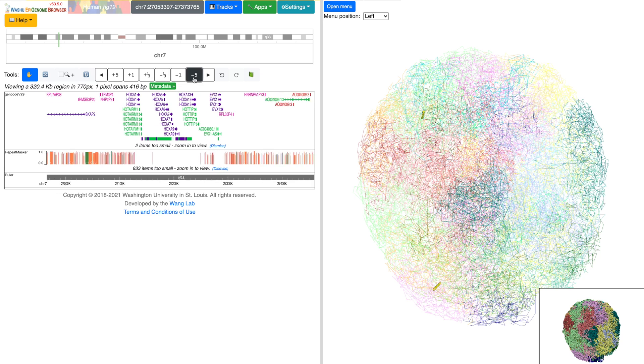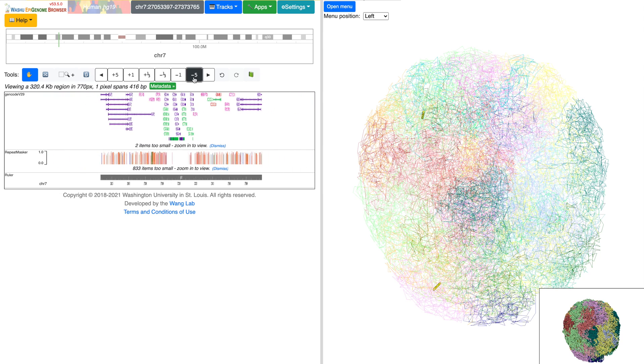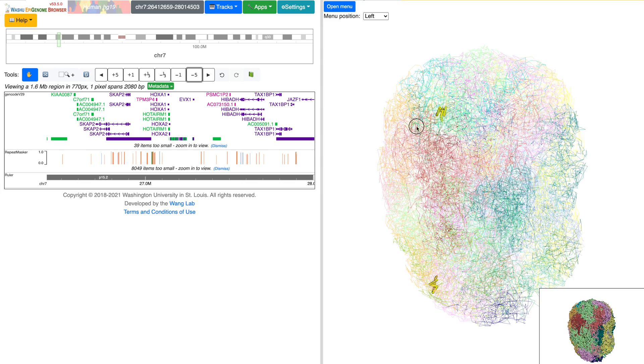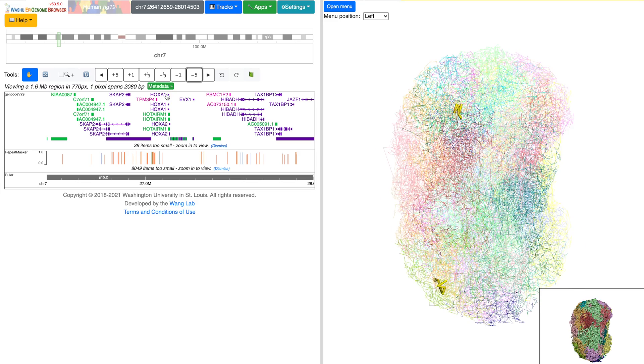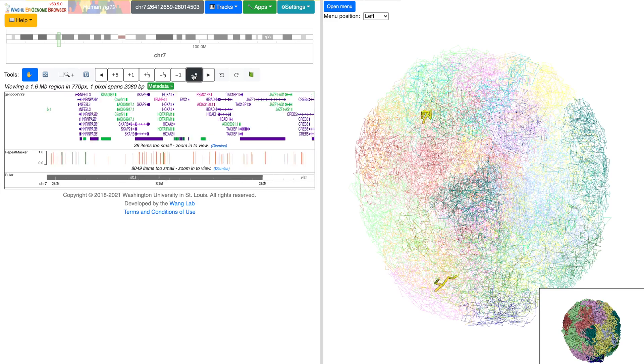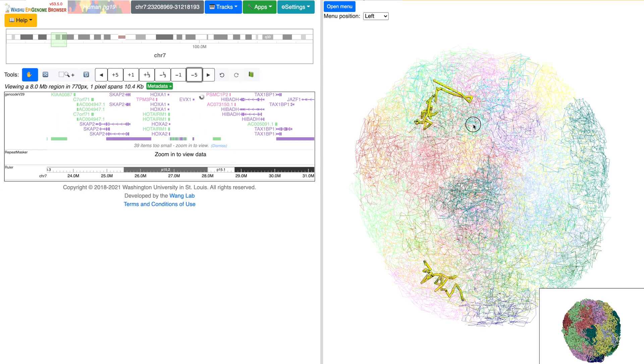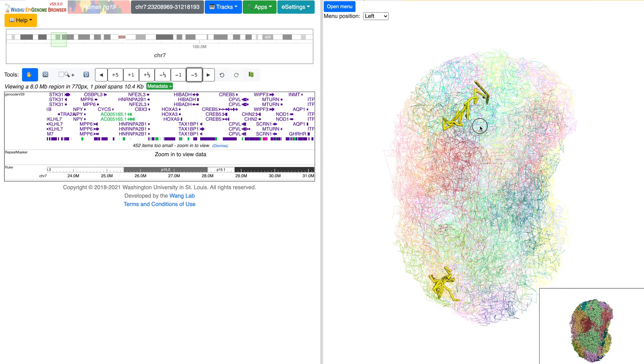The thumbnail and the browser are synchronized. Therefore, any changes on the browser will result in the 3D highlighted region changing accordingly.